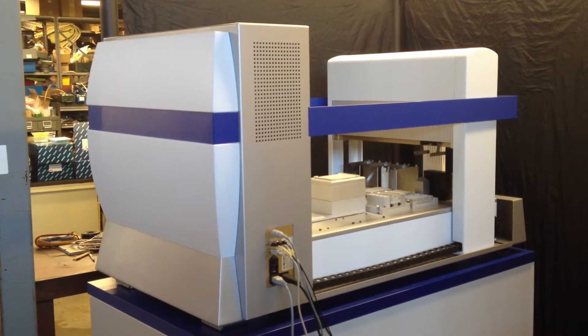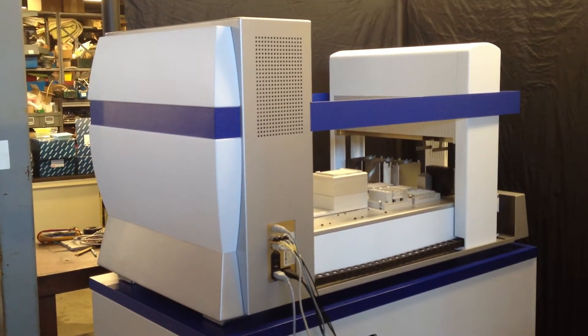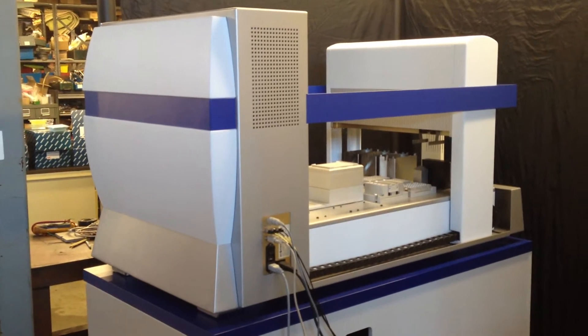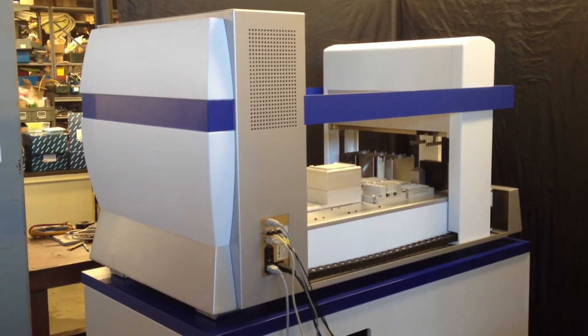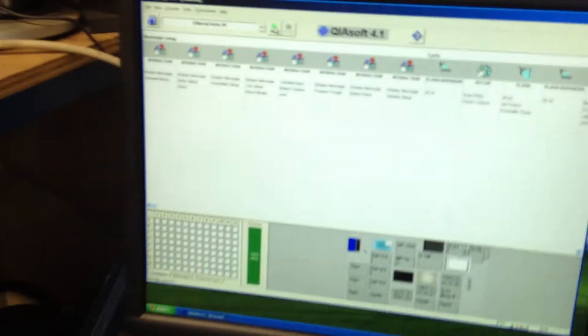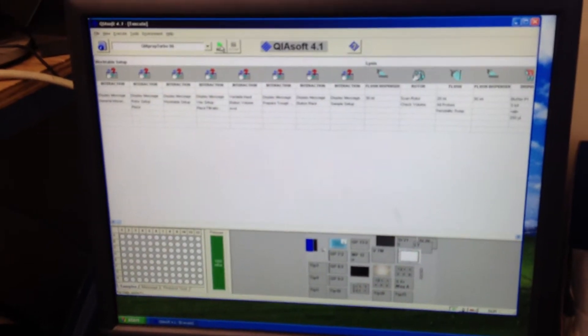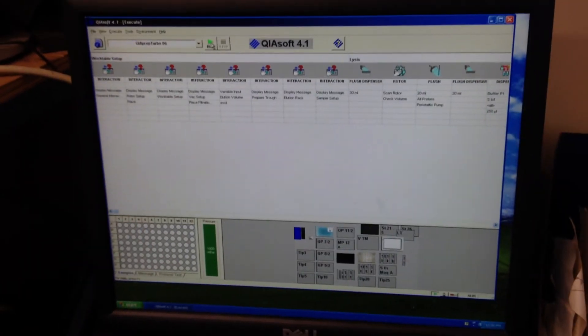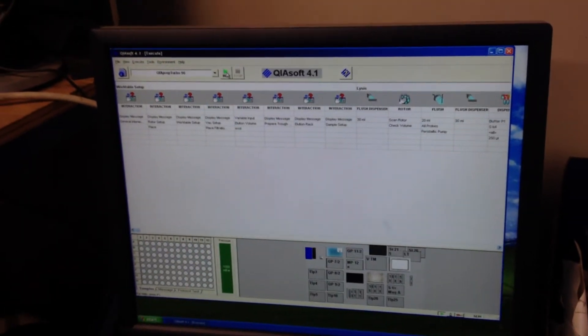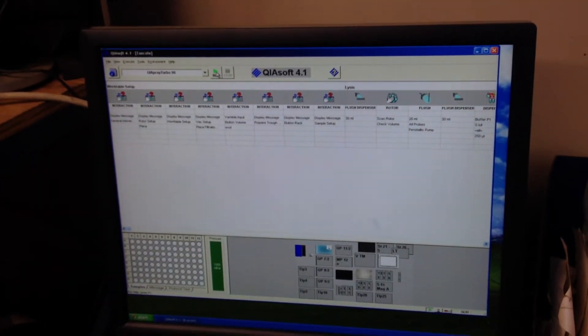Here we have a BioRobot 8000, and we're doing a simple communication test just to prove that the robot responds to the inputs from the software. So here we installed the software on a Windows XP computer, and we'll just start a program. We don't have any fluids in the unit or anything, so we'll just watch it home itself.